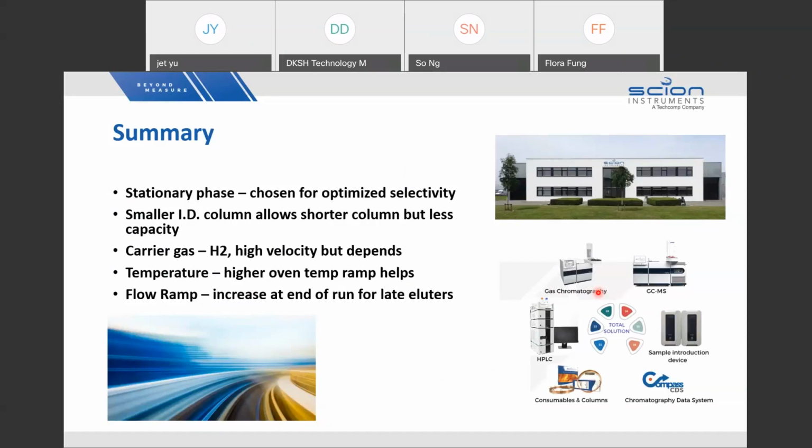If you are from a testing lab, you think more about revenues, in terms of cost and also your charge to customers. If you have very efficient methodologies and can get results in 10 minutes, you can charge cheaper, for example, and also have an advantage over competitors. From a research perspective, the starting points are different, but you think more about resolution and separation rather than time.